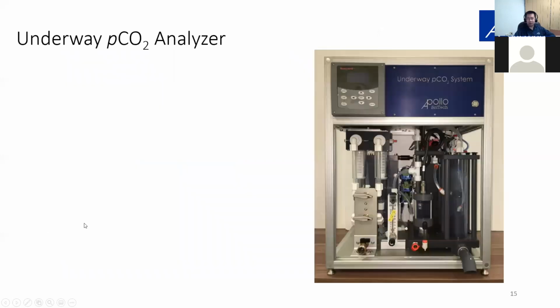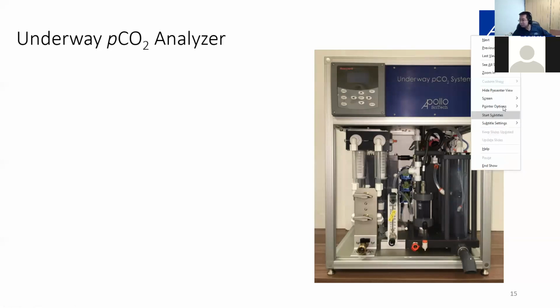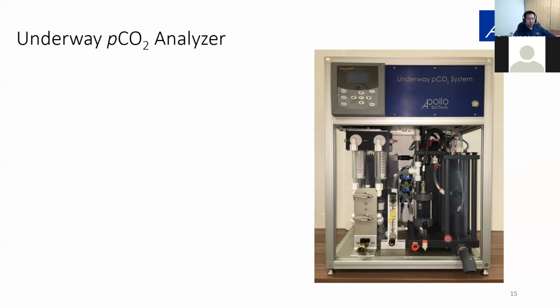Okay, so now the underway pCO2 system. This system is used for the underway pCO2 measurements aboard a ship. And water is continuously pumped into the equilibrators while the ship is sailing.